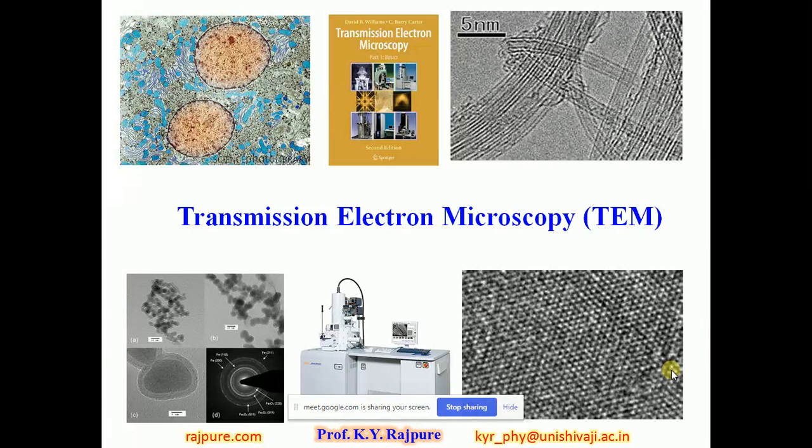This is the facility which we are soon installing in the Common Facility Center of Shivaji University, Kolhapur. I have already taken a few lectures on the analytical techniques so far as material characterization is concerned. But today is the important topic, transmission electron microscopy. Its short form acronym is TEM.